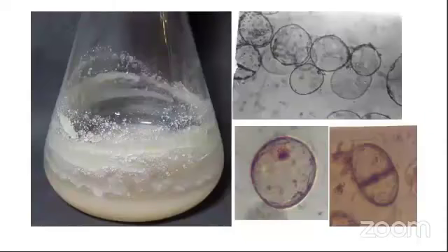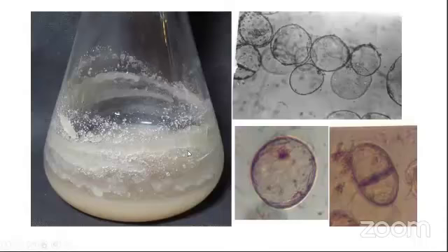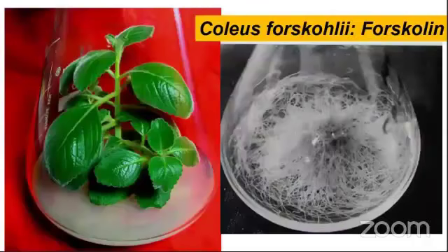And after that, this callus is transferred into liquid media. It is a liquid suspension culture of a particular plant species. And you see the single cells here dividing within the suspension system. So cell culture is also important to synthesize the secondary metabolites.